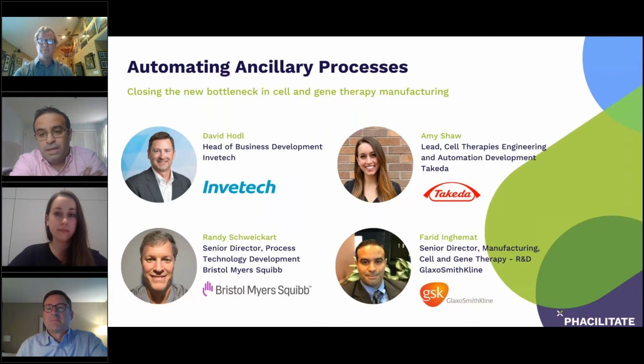I do agree with the point that Amy made here, and that's the fact that the field of cell and gene therapy, again focusing on autologous, will also change and will most likely go towards smaller volumes, smaller apheresis, leukapheresis material from the patient themselves, so that they don't have to go through long, arduous apheresis processes, and smaller vector volumes for that transduction, etc. So it needs to be adaptive as well.